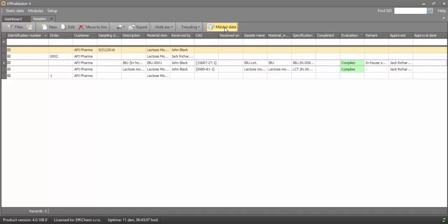And you can create as many of these master data templates as you need. So you can have one for a particular spec, then a second for another spec, then a third, etc. As you can see here. By using this data function, you save yourself the time of creating a completely new record whenever you enter it. Over the course of a year, that's going to be a lot of time. Now, how do you make this happen?